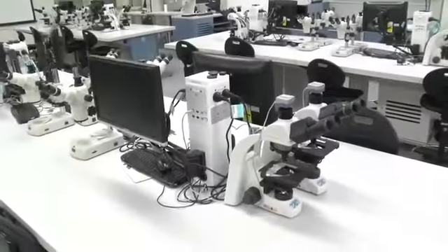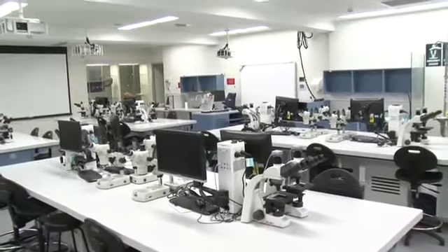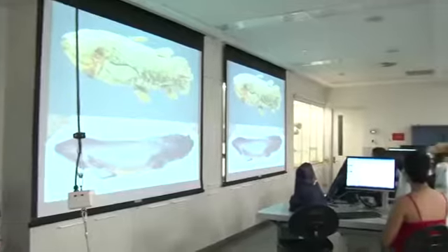We hope you enjoyed this short tour of the Biology Digital Teaching Labs and that it's given you an insight into the exciting teaching facilities on offer at Macquarie University.